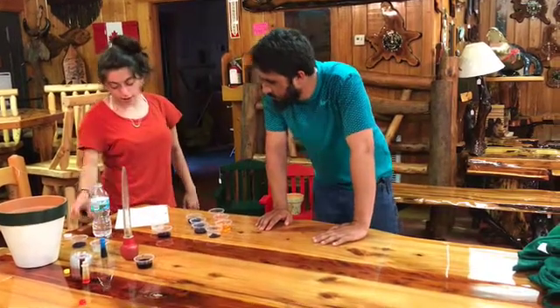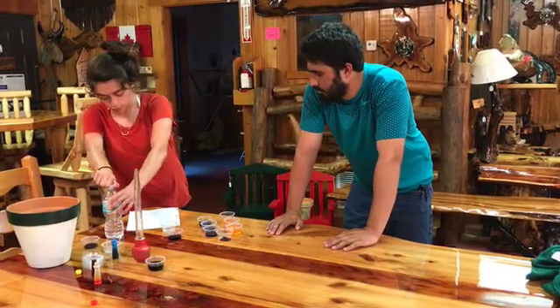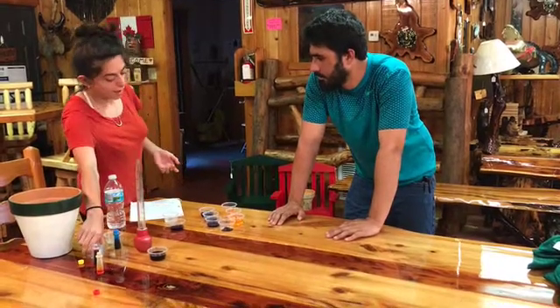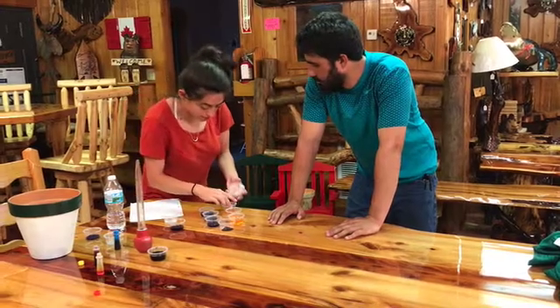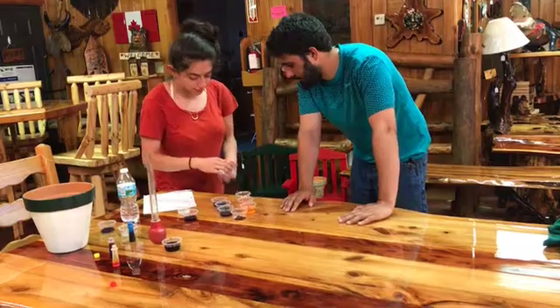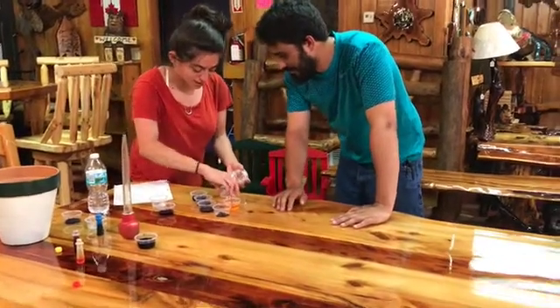Okay, so now we're going to let them sit at room temperature. First we're going to gently invert them after we add our parafilm to them. So we invert it. Don't squish it.